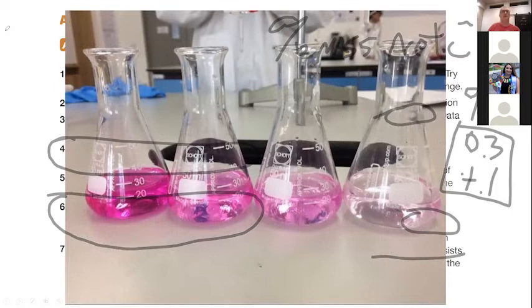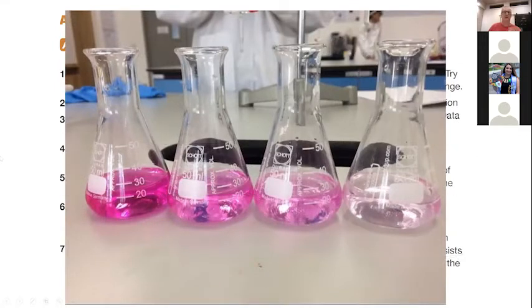Basically, what we're looking for is this at the end. This is a perfect titration. So that is extremely pale pink. That's perfect. I mean, you'll be lucky to get that, because you're going to do the titration several times. You do it like 3 times. But that's what you're looking for, that color right there.